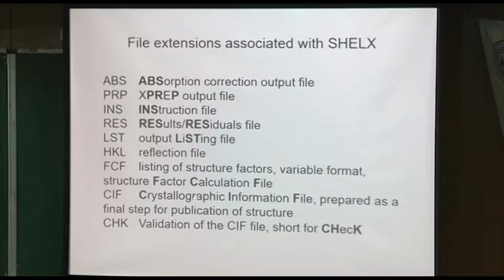CIF, crystallographic information file. That's the last thing you do when you're solving and refining a structure. Usually it takes several iterations before you're happy with the CIF, but when you go to publish, that's what you send in. Virtually all the journals require that now. And then that will be archived in the Cambridge Crystallographic Database. We'll spend quite a bit of time talking about CIF. I think that's where a lot of people get stuck.